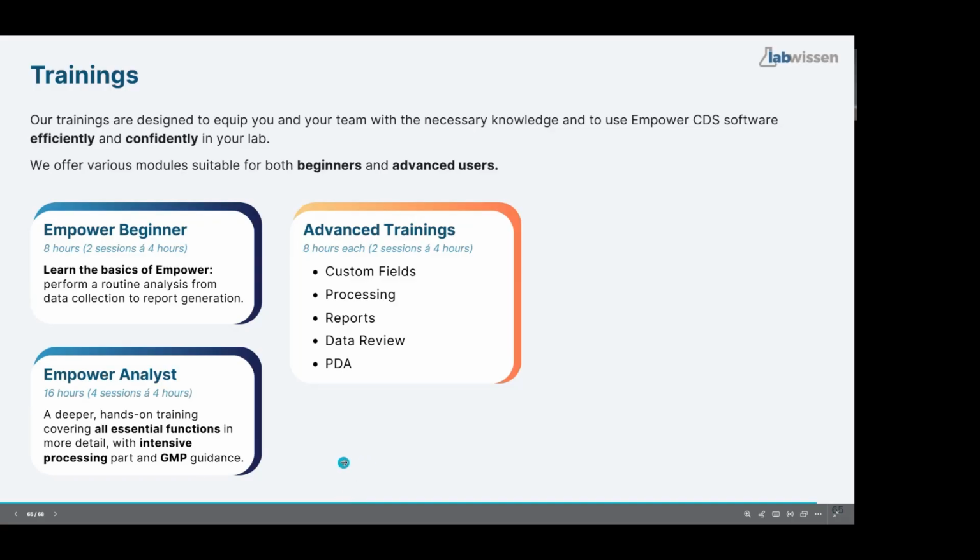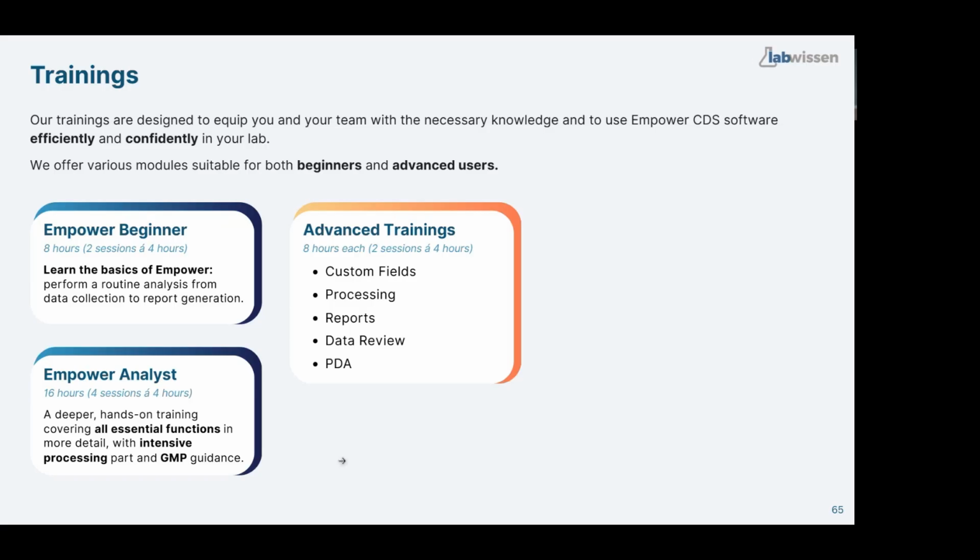Also, before the training, I ask you to send me some of your requirements or examples so we can build them together. There are also many extra things we can do with custom fields, extra functions, like how to use them in your report methods, how to use these CCAL ref fields, and other things. So we've learned maybe 20% now, and there is 80% more. Okay, maybe not 80. Like we learned 40 and we have 60 more.